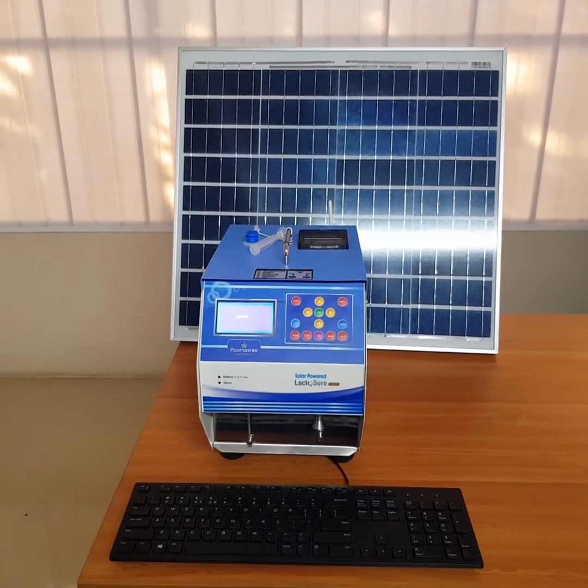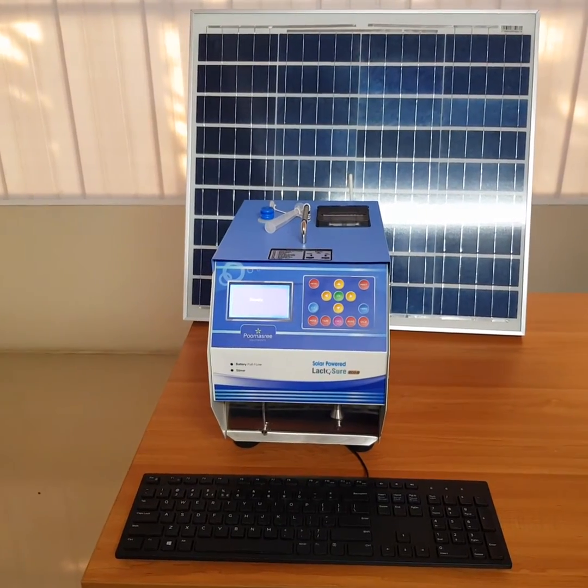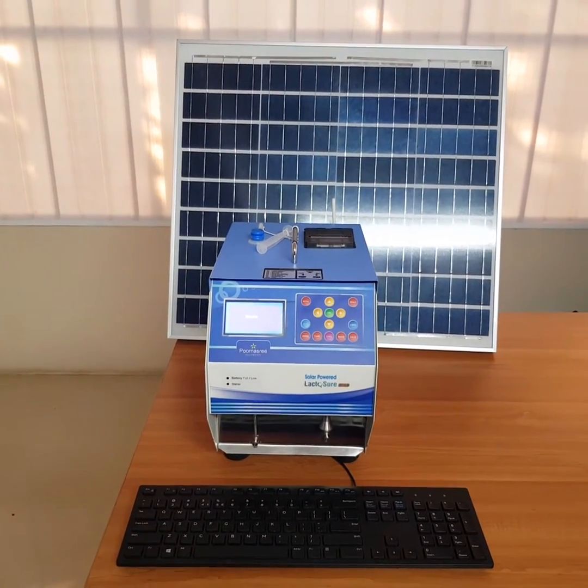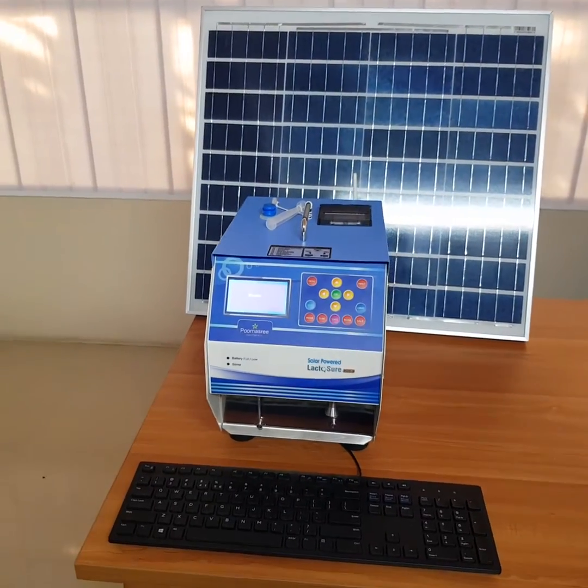LaktoShare EcoDS is the most popular all-in-one bone type milk analyzer made by Purnasri Equipments, and it is the most needed analyzer for dairies and farmers alike.